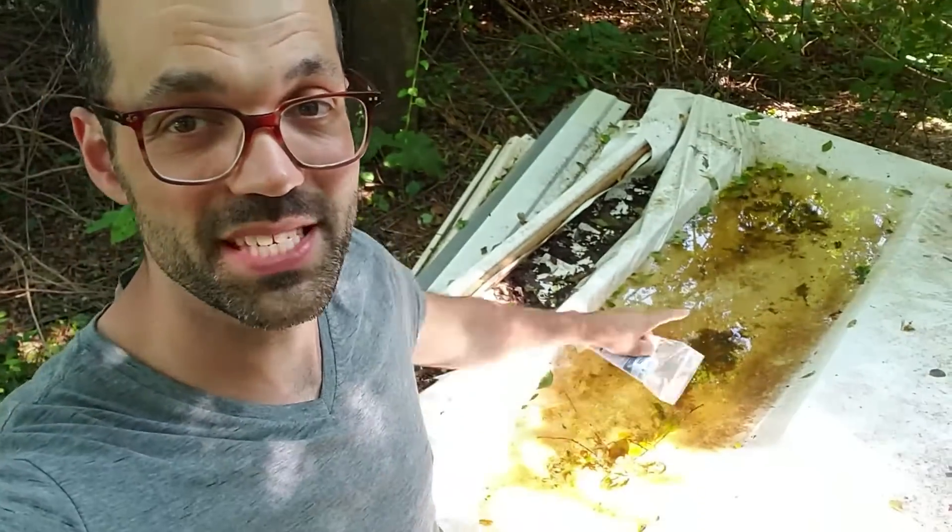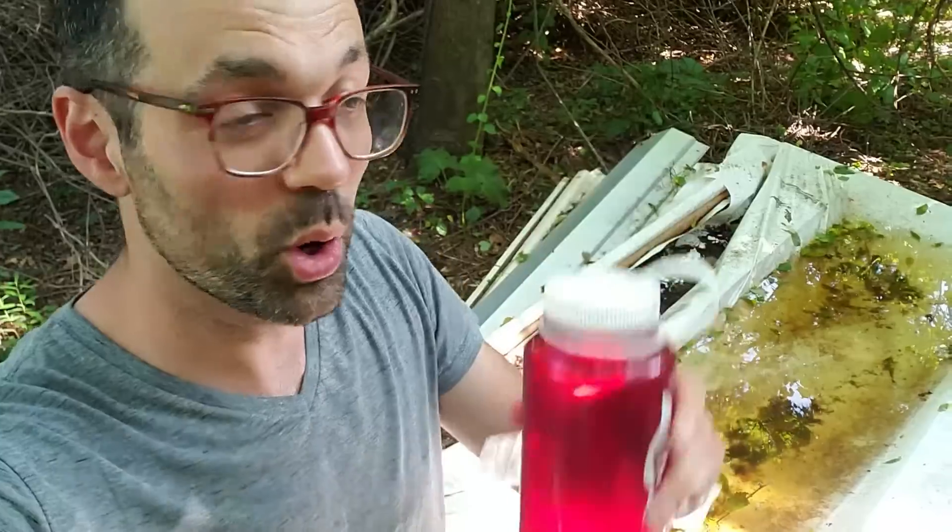Hey guys, I have some AquaTabs and some standing water. I'm going to grab a sample and put it under a microscope. We'll check out all the bacteria and organisms in this water, then we'll treat it with one of these AquaTabs and see the results under the microscope.